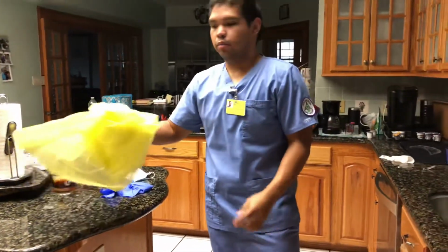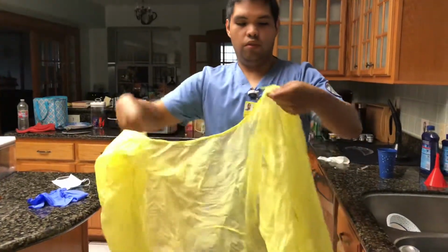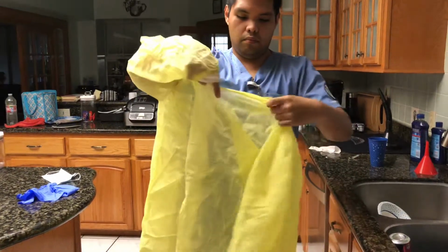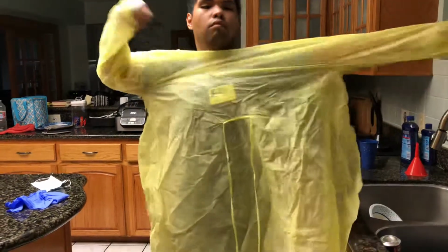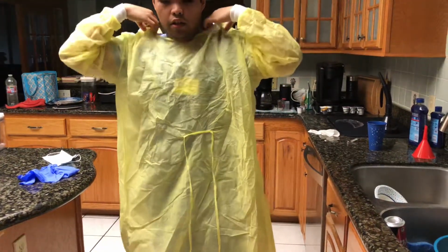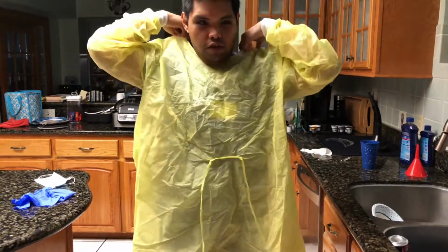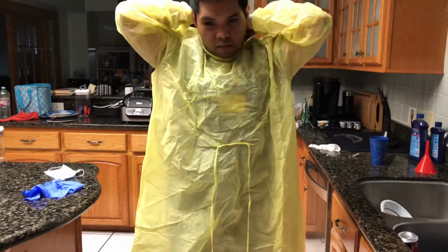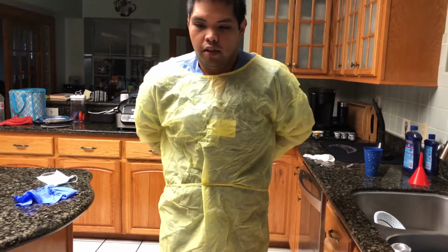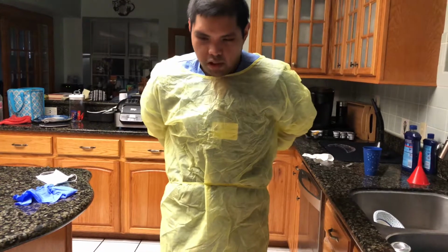First thing we're gonna do is put on the gown. So open it up. Now you're gonna go through your sleeves first. Right. Now the next thing we're gonna do is tie it. The bottom ones you can either tie to the front if you want or to the back, and then you have to tie your neckties. At the moment my neckties are broken, so make sure that you tie this snugly and make sure that you're all covered up. In this circumstance my gown is broken, so just make sure that you tie the necktie firmly. So I'm gonna tie mine on the back.